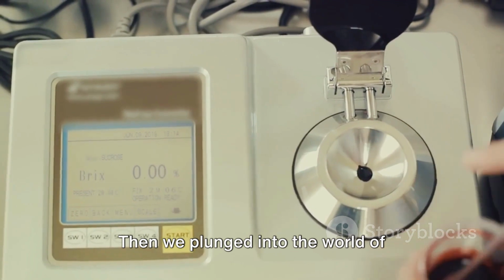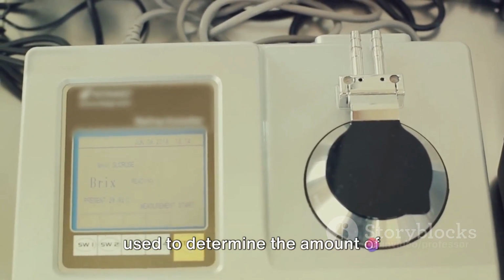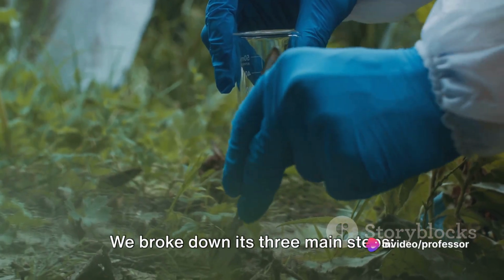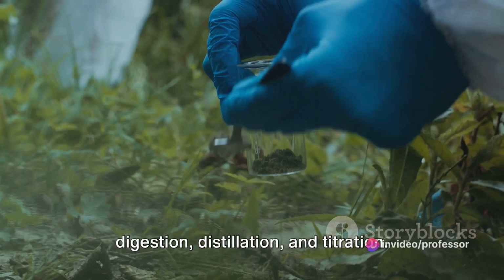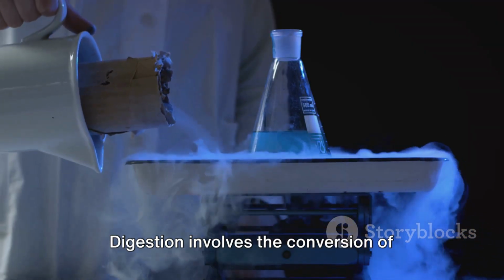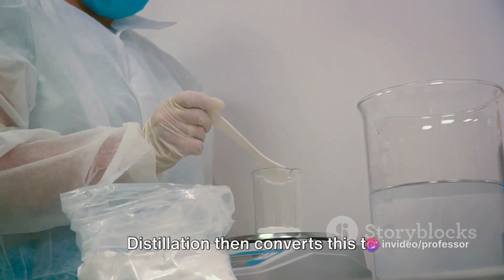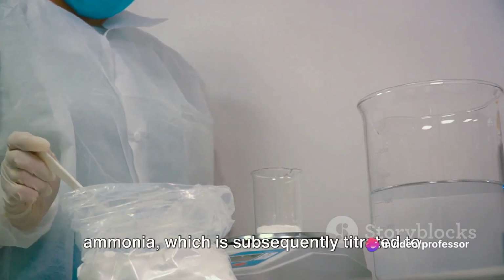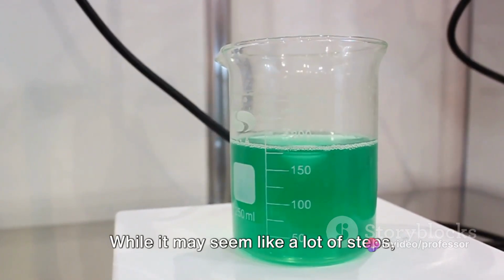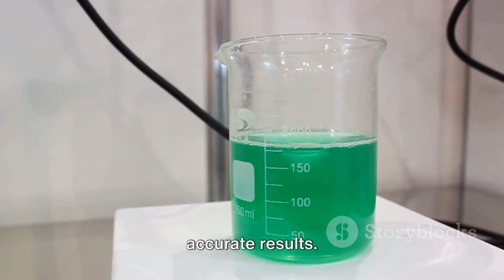Then, we plunged into the world of Kjeldahl's method, a classic technique used to determine the amount of organically bound nitrogen in a sample. We broke down its three main steps: digestion, distillation, and titration. Digestion involves the conversion of organic nitrogen to ammonium sulfate. Distillation then converts this to ammonia, which is subsequently titrated to quantify the nitrogen content. While it may seem like a lot of steps, each one plays a crucial role in ensuring accurate results.